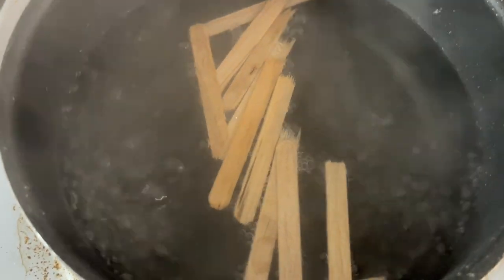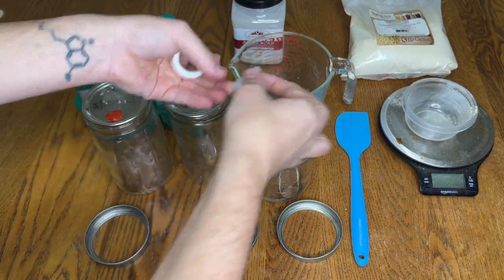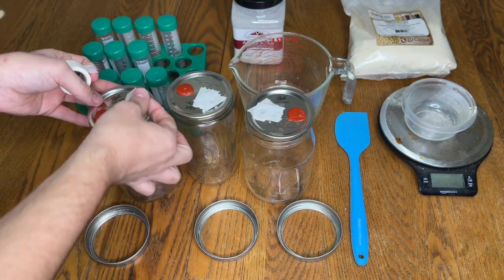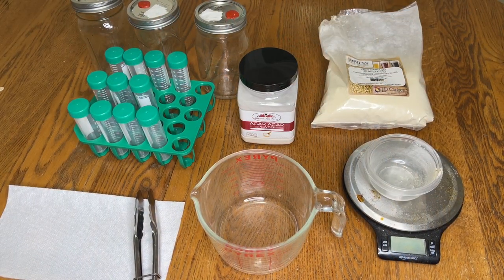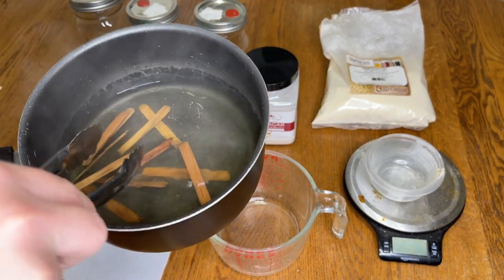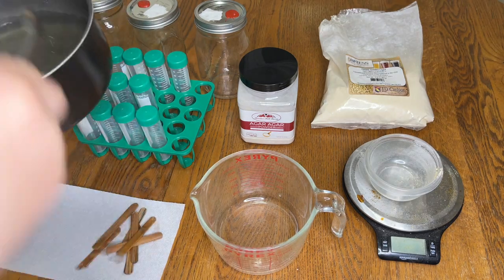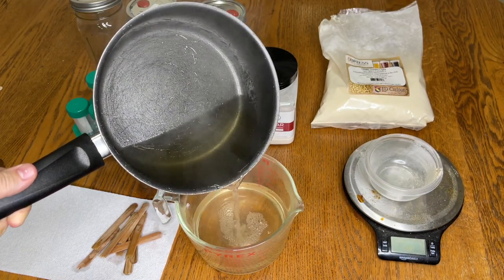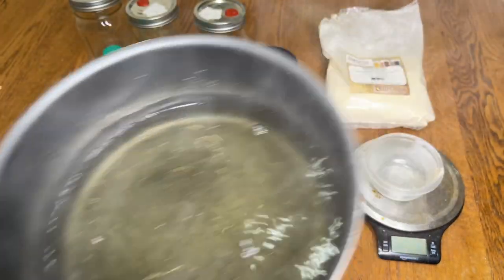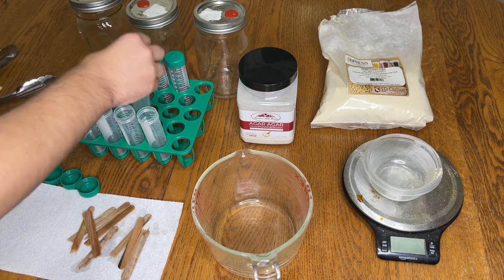The first step is to boil the popsicle sticks for about 30 minutes. While the popsicle sticks are boiling, you can start putting two pieces of micropore tape onto the jar lids. After 30 minutes, the popsicle sticks are removed from the water. The water is then measured to make sure that we are retaining at least 500 milliliters for the agar. The water is then returned to the stove to continue boiling. The centrifuge tube caps are removed and the popsicle sticks are added.